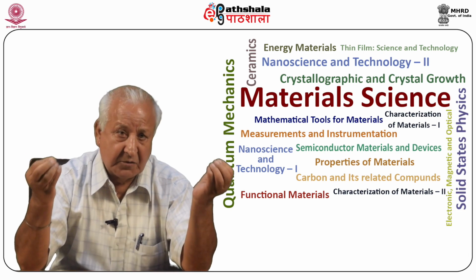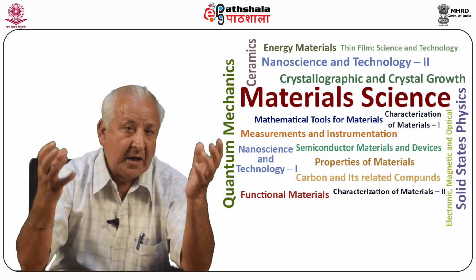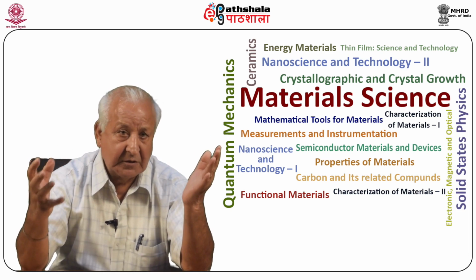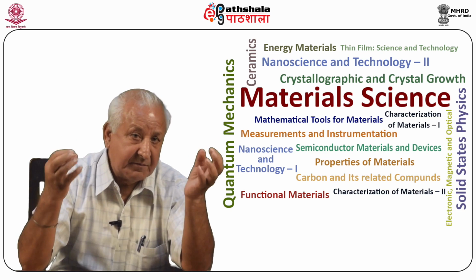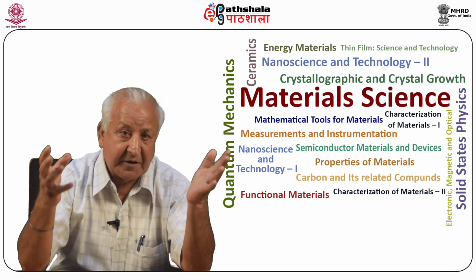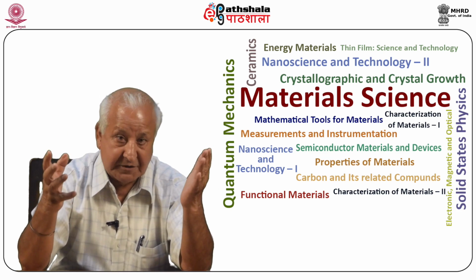Gel technique of crystal growth. The gel technique of crystal growth is the most simple and versatile technique compared to other methods of crystal growth under ambient conditions. Since the method involves minimum technological sophistication, it has been exploited for the growth of useful crystals suitable for research and technology.